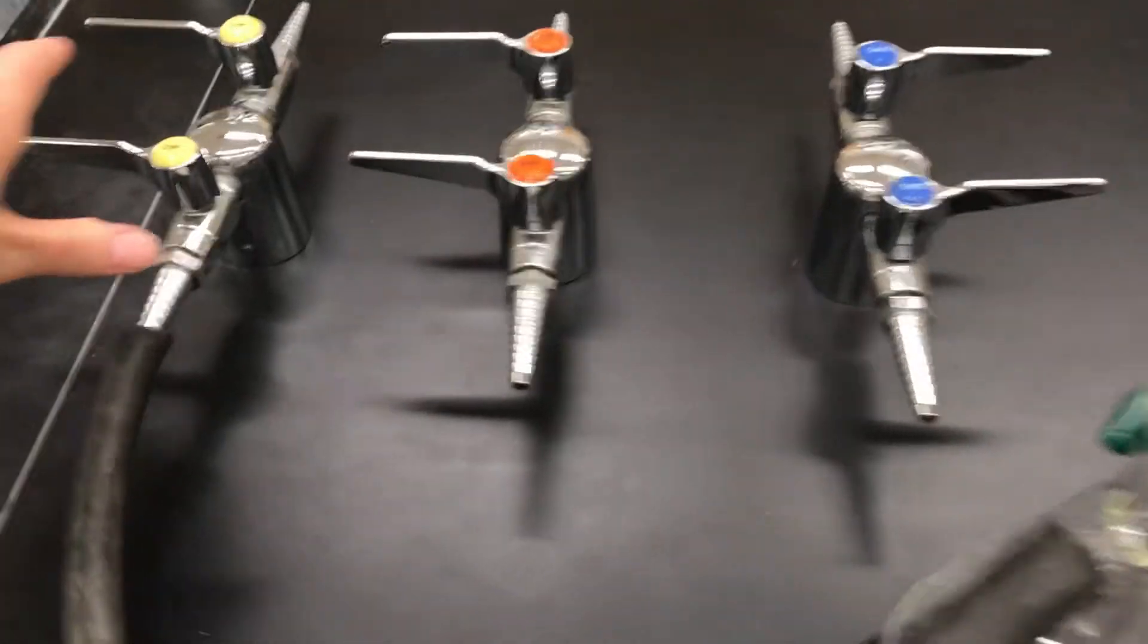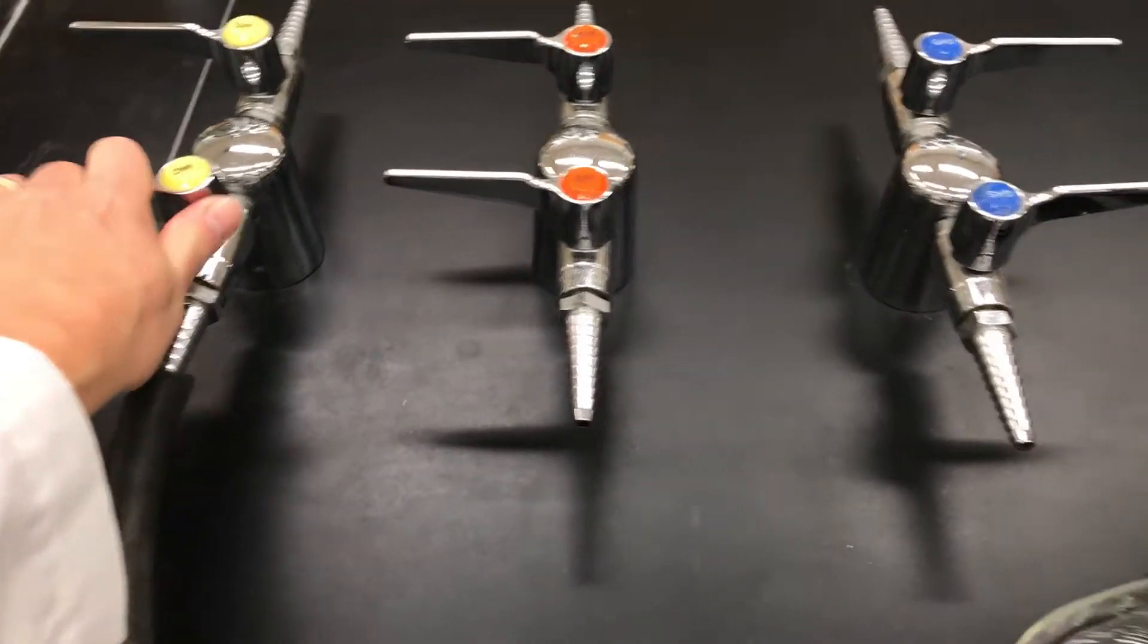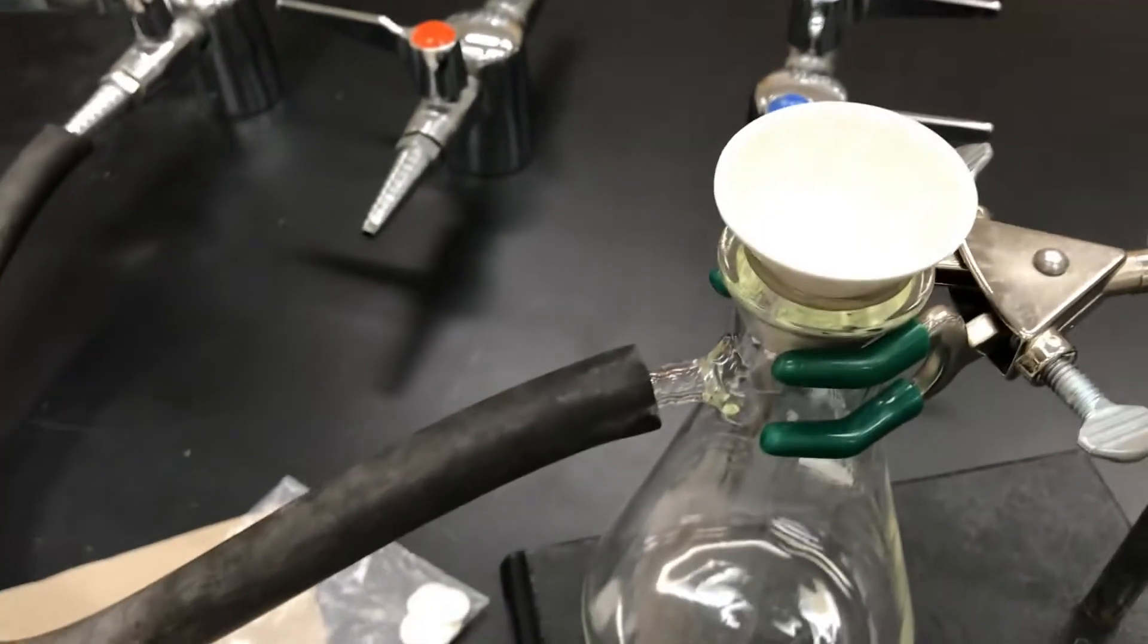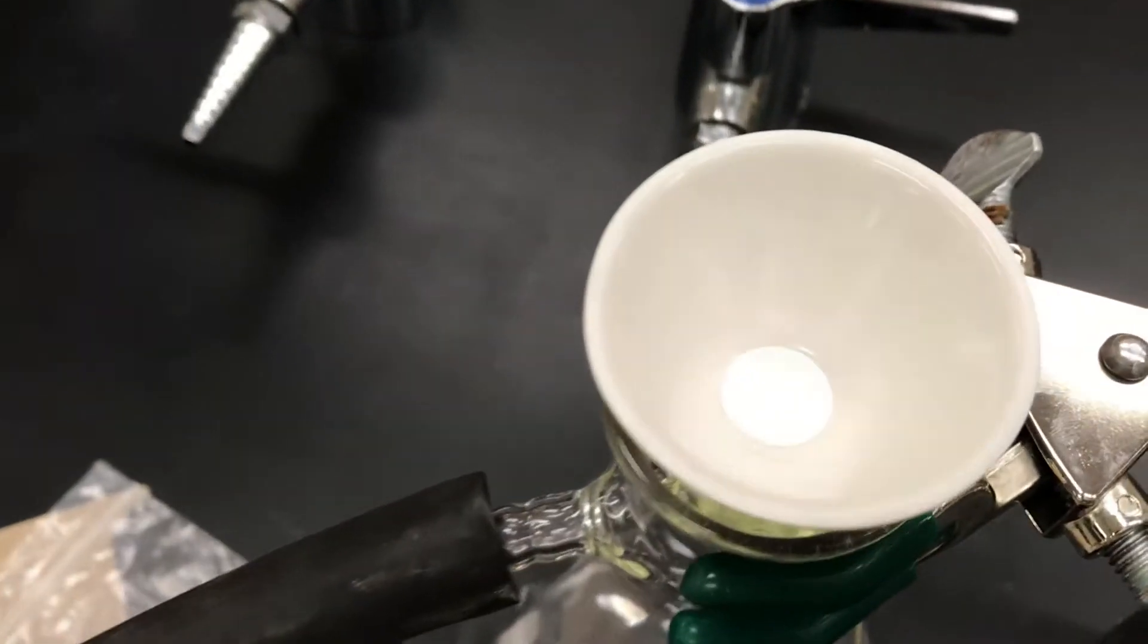To start filtering, you'd want to first turn on the vacuum, and then you might want to push down on the funnel to make sure that it's a good fit.